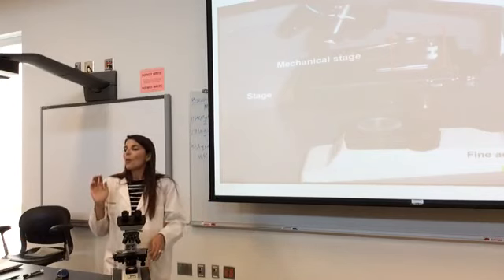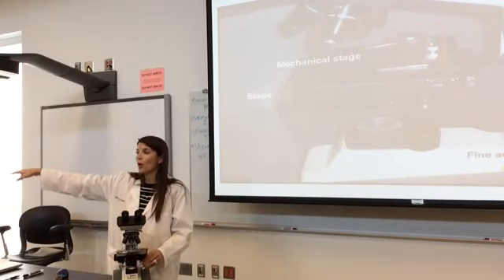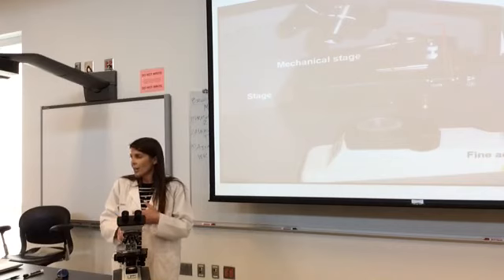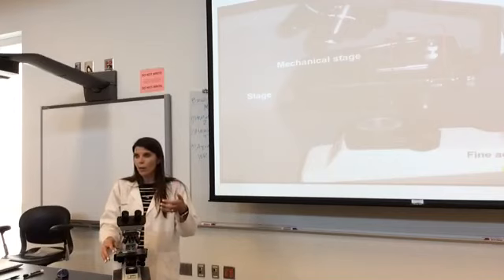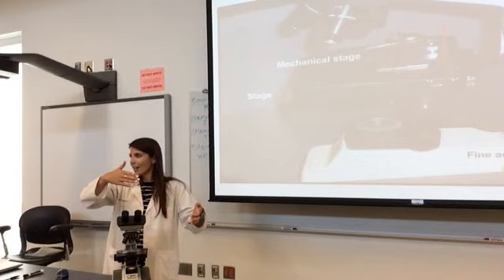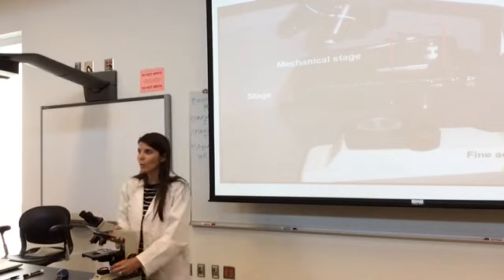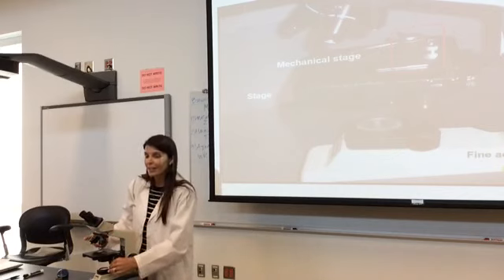When you go to practice, we have slides already over here that you are welcome to use. Some of you may have brought your blank microscope slides, and you can use those just to practice using this microscope. But you open up that claw, you place the slide in that top right corner, you release it, and it gets that slide in a snug hold. That now, when you use these stage adjustment knobs on the right, you actually move the slide.